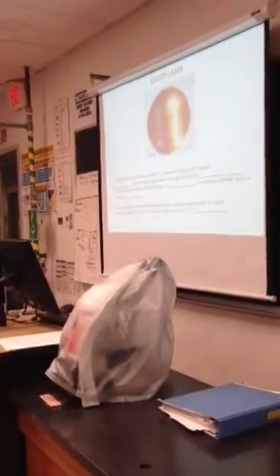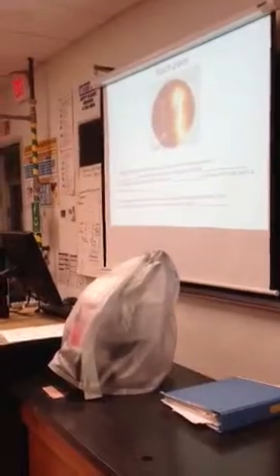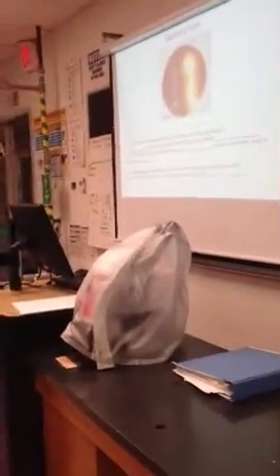Bacillus subtilis digests everything. It breaks down starch, gelatin, and casein. It's a soil organism. Soil organisms are tough. They have lots of enzymes because they have to eat whatever food is present. Why is E. coli negative for starch? It doesn't produce the enzyme.